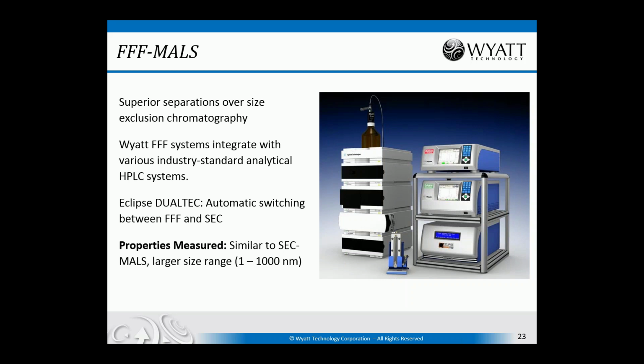The properties which are measured using FFF-MALS are similar to those using SEC-MALS: molecular weight, size, conjugation, etc., except that they work over a much larger size range because FFF can separate between 1 and 1,000 nanometers. It's very versatile.